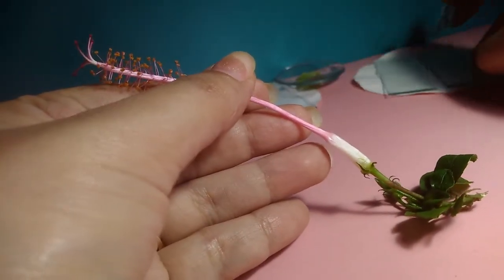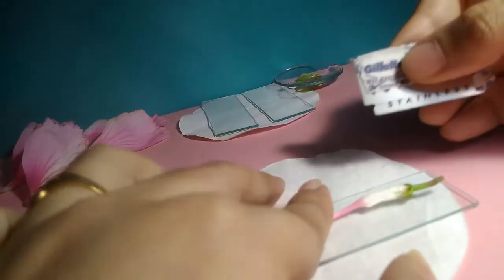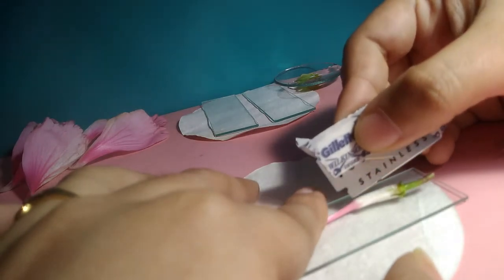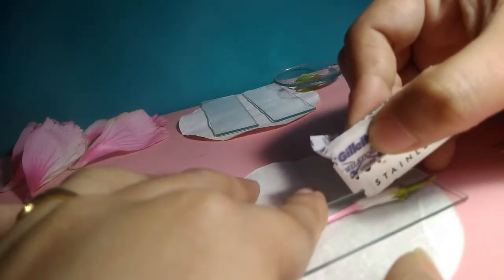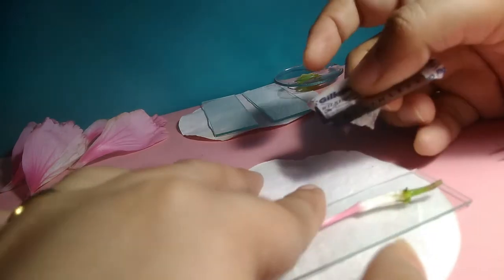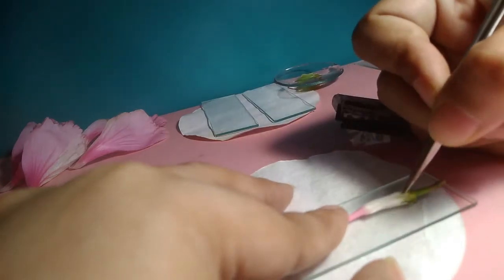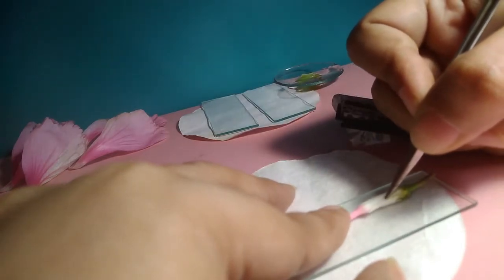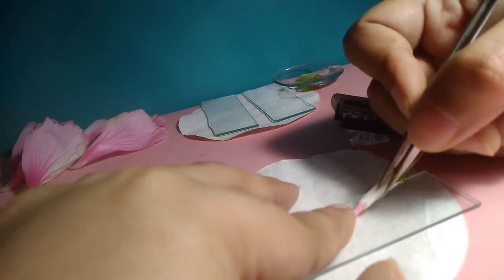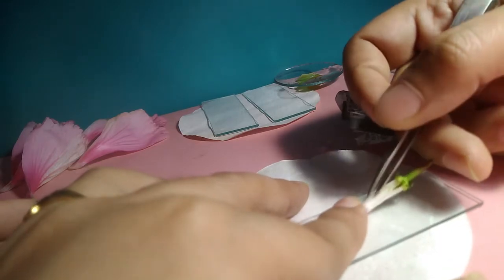For that, I will take a blade here. Be gentle, do not make a very deep cut, otherwise you may end up cutting the ovary, and we do not want to cut the ovary. Now try to separate it with the help of a needle or a forceps, whatever you have.